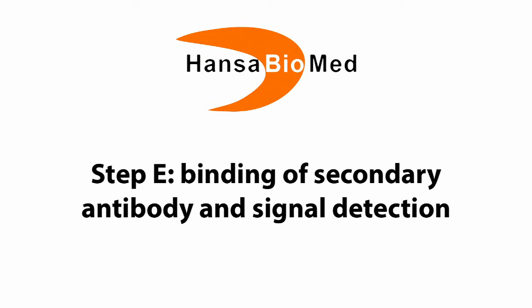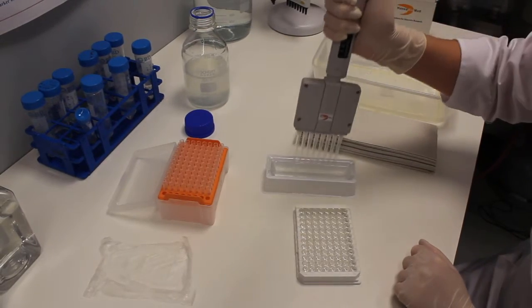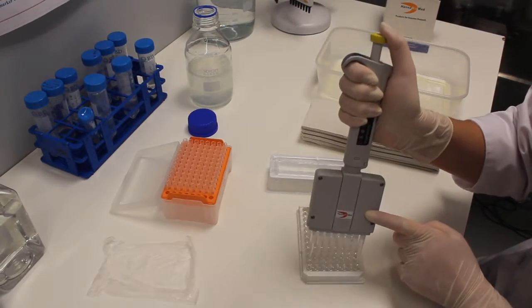Step E: Binding of secondary antibody and signal detection. Wash the plate with washing buffer as described in Step C.